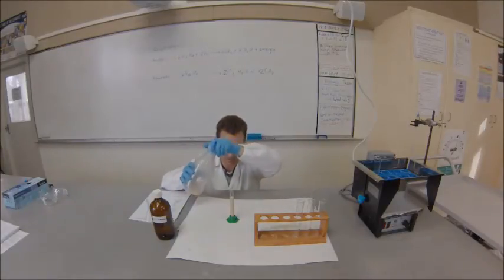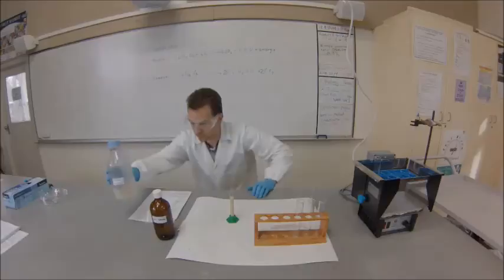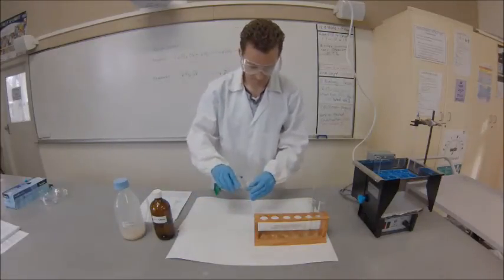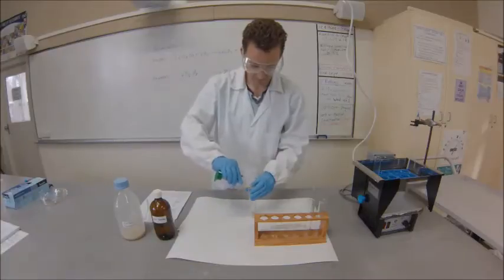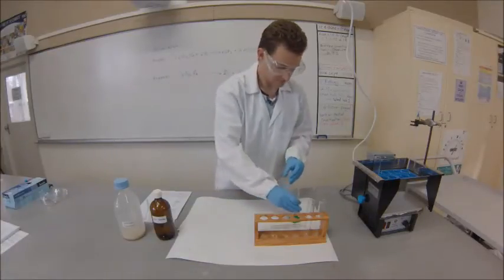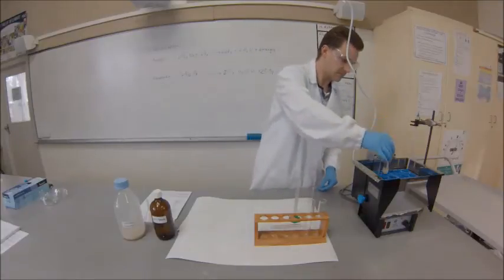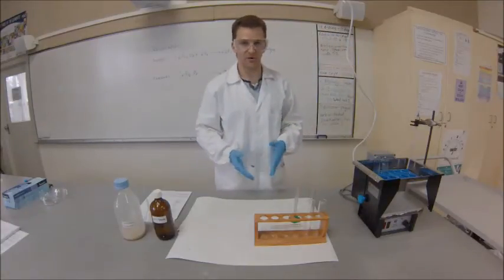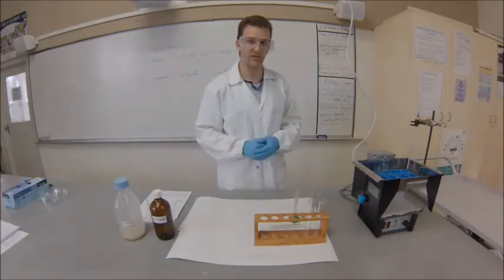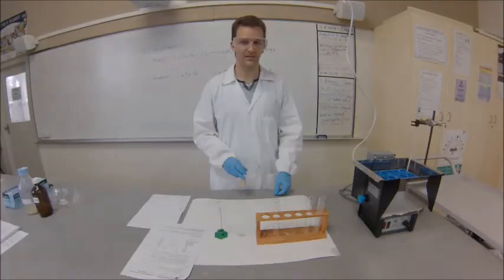It looks a tiny bit over, but that's because of the bubbles - the actual solution is at the level. We're going to let them sit in the water bath for maybe up to 15 minutes, basically just long enough to get the temperature to the same as the water bath.